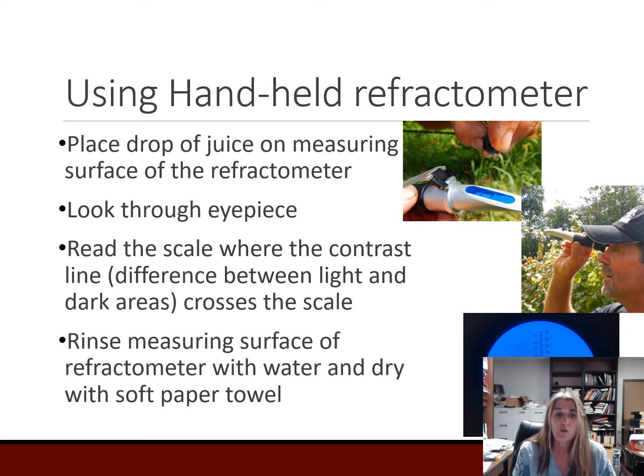You want to be sure to rinse the measuring surface of the refractometer with water and dry it with a soft paper towel between each measurement.